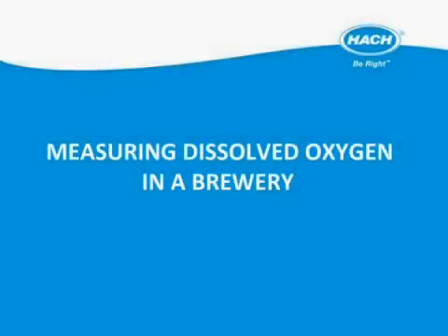Today I'm going to give you a brief overview of measuring dissolved oxygen in a brewery, looking at things from maybe a 30,000-foot view and then occasionally drilling down. What we want to do here is go over an overview. What is dissolved oxygen in a brewery? Why are we measuring it? And how do you measure it?